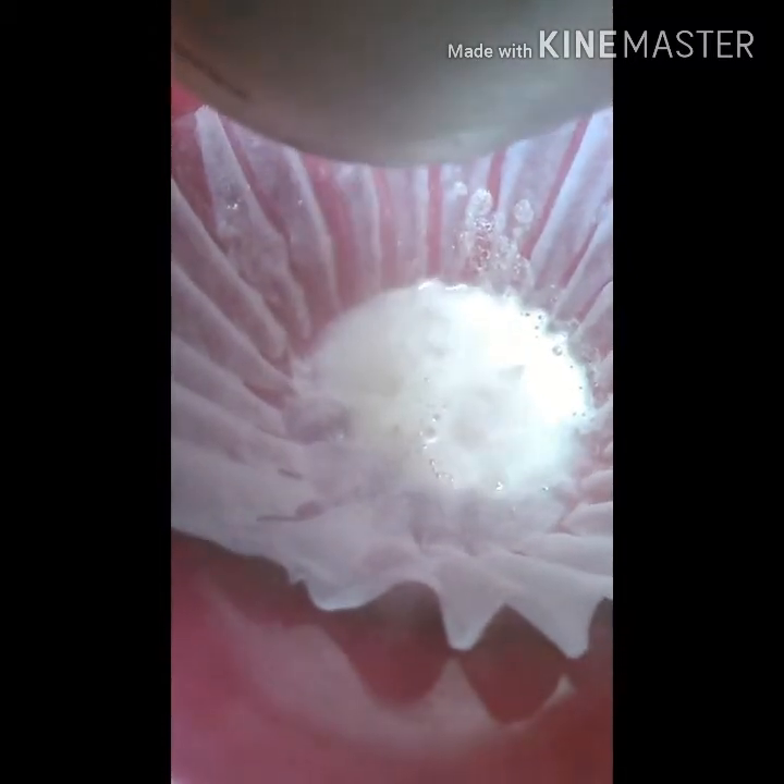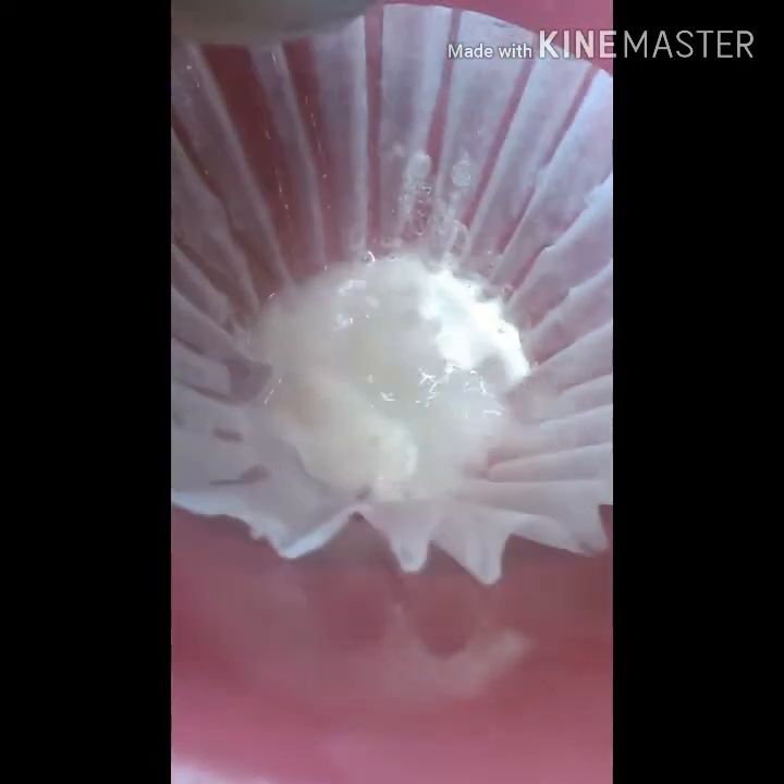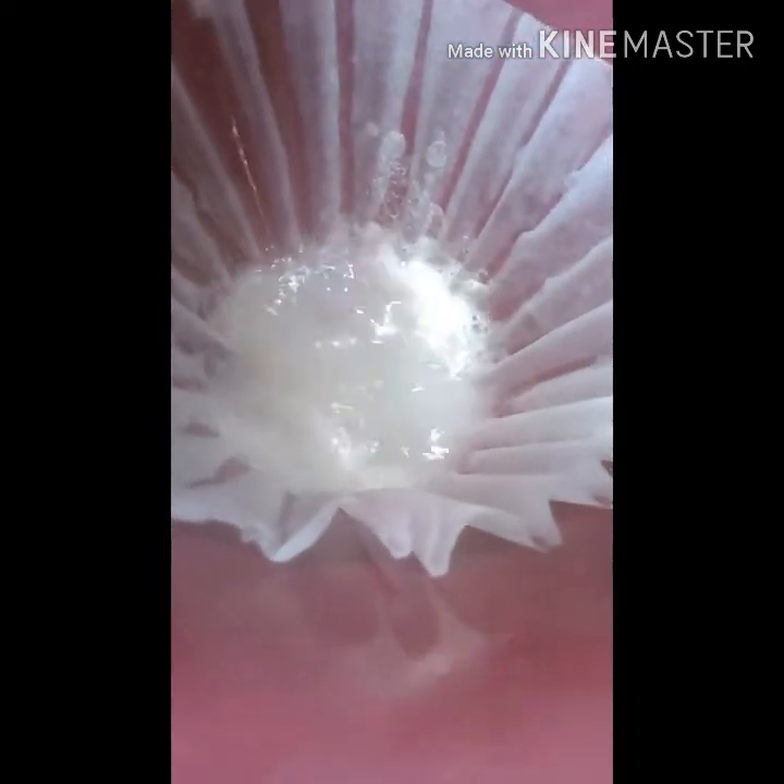Letting it sit is especially important if you've got the calcium ammonium nitrate. The reason for that is the amount of calcium that's going to settle out, so that way you don't plug up your filter all in one shot and then filter real slow. I'm going to filter all this and then when I'm done, I'll be right back.